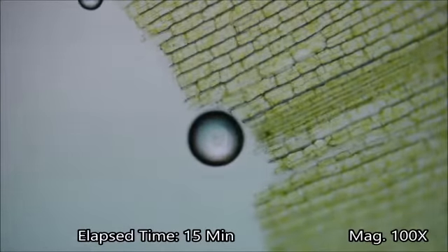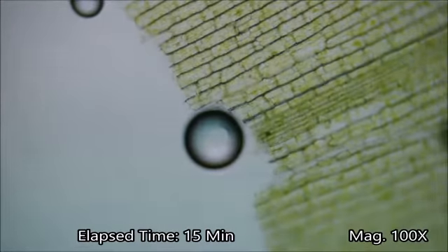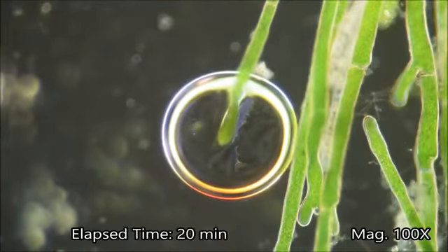Here we can see an oxygen bubble growing and the chloroplasts in the plant cells moving around. We see a lot more oxygen bubbles than carbon dioxide bubbles for a few reasons.